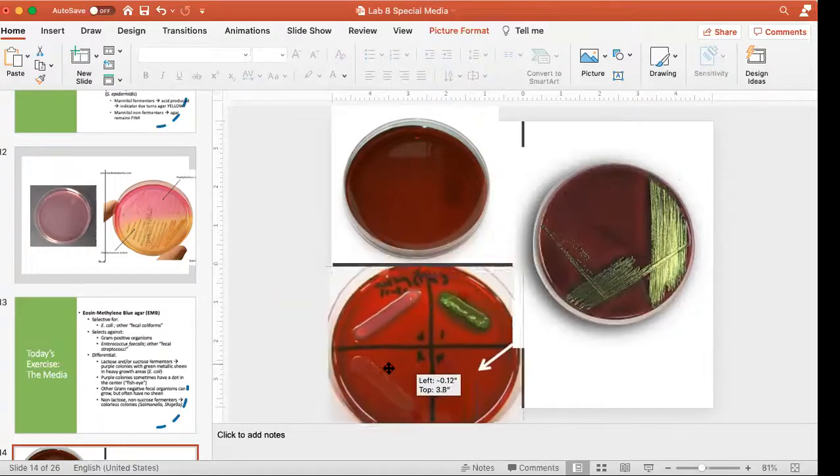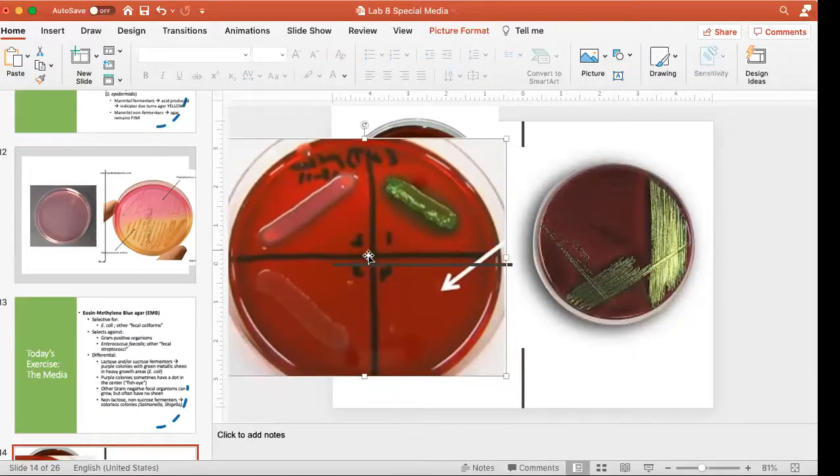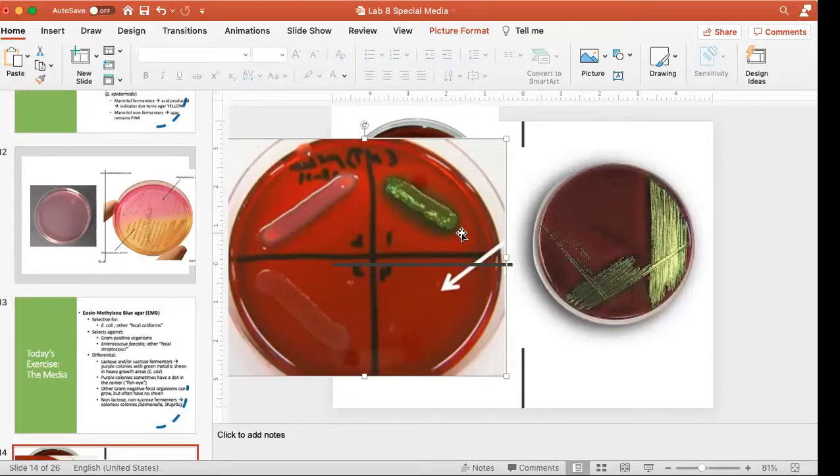Now, on this plate, we can see other organisms growing on EMB. Take a look at this one. You can see this plate has been divided into 4 quadrants. This is EMB, even though it doesn't look quite as dark as this plate does. It is EMB, it's just under a strong light. So this is what E. coli looks like, again, when it grows on EMB. It's a purple colony, and again, this is just a big smear of cells. This isn't a colony, but it's a purple colored growth that shines this green metallic color under the light. Only E. coli will grow like this.